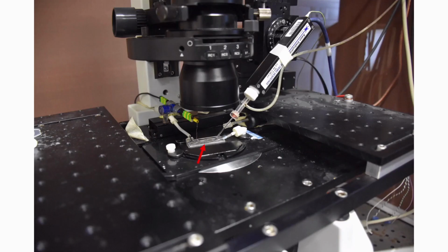In order to perform this technique, we need to fill the experimental chamber with an appropriate bath solution, a solution containing nuclei. Then, after finding and isolating a nucleus with the microscope, we can bring the micropipette close to the nucleus membrane and apply pressure from 4 to 10 mm of mercury to create an impermeable seal between the pipette and the membrane. At this point, we are ready to measure the channel's activity.